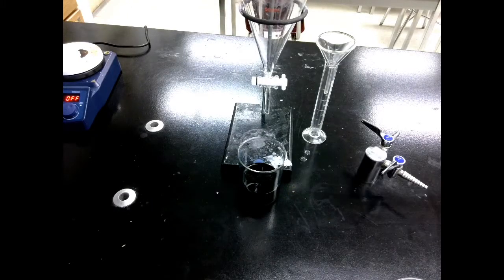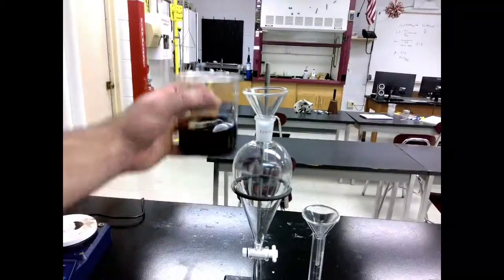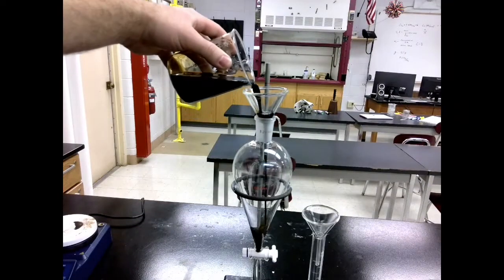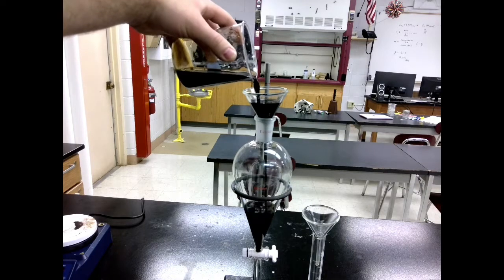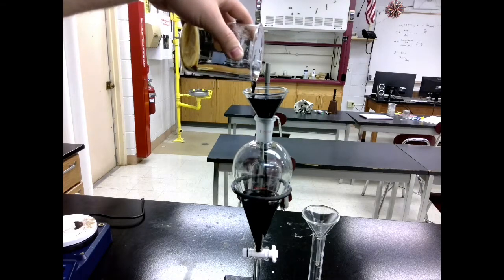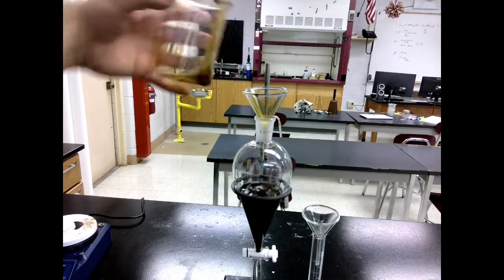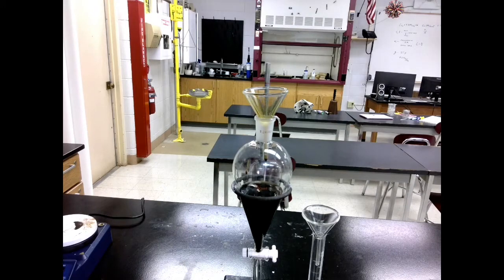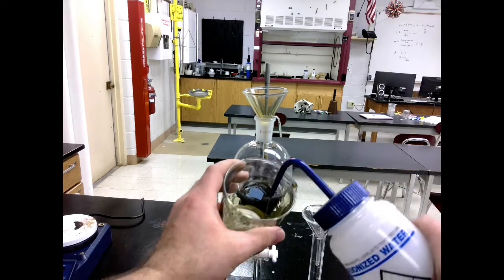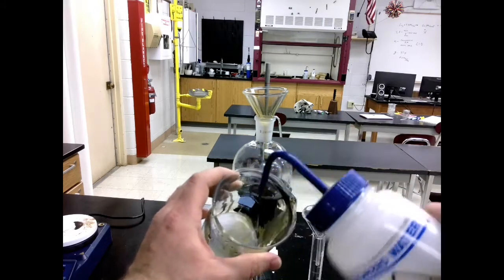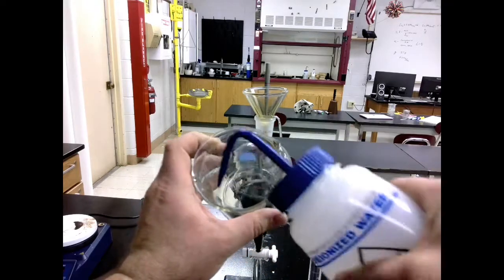Now that our solution is cooled down, we're going to pour it into a separatory funnel. Make sure that your separatory funnel is closed before you pour anything in, otherwise it'll just fall out the bottom. That wouldn't be good. We'd lose all our product. And then we're going to use a wash bottle just to get as much of that tea out as we can. We want to try and collect everything that we possibly can.